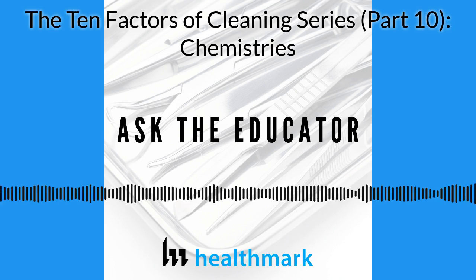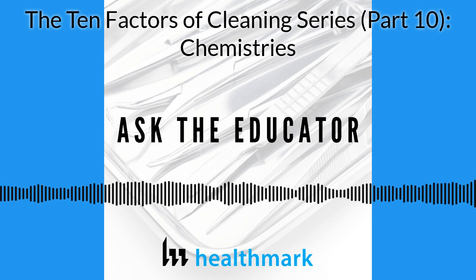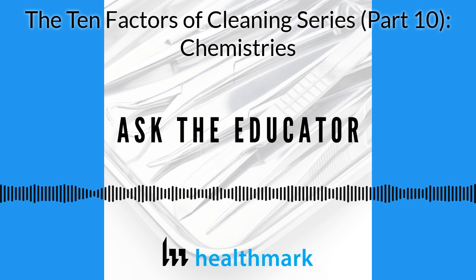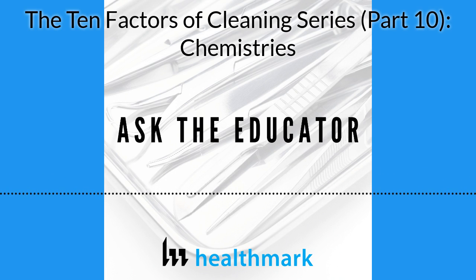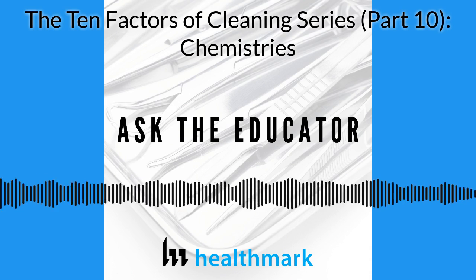One, you can have an alkaline detergent, and that's used a lot in Europe. With that, you might need a neutralizer. Then you have neutral detergents, and then you have cleaning solutions or detergents that are enzyme-based. But all of them have some common terms. I think one of the biggest ones is a surfactant.